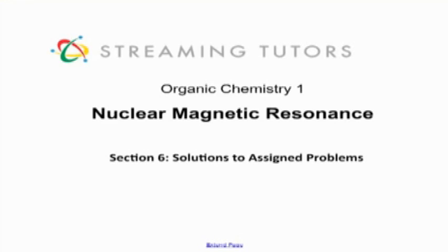Hey everybody, welcome back to Organic Chemistry. In this video, I'm going to go over the problem solving that I assigned for the NMR spectrums. So this is the wrap-up video. This is the last video for this chapter.